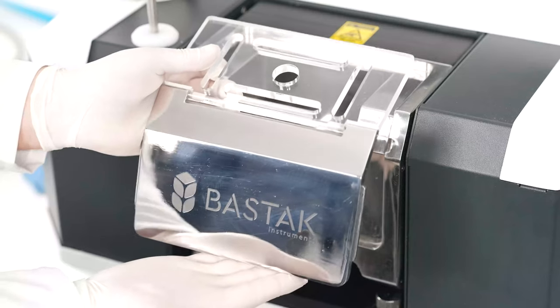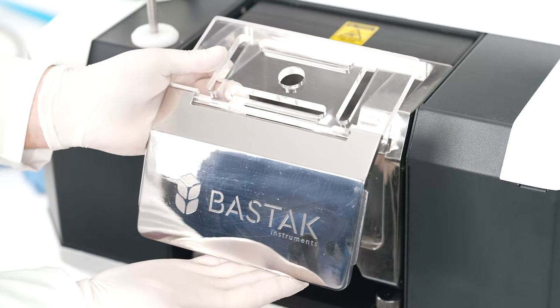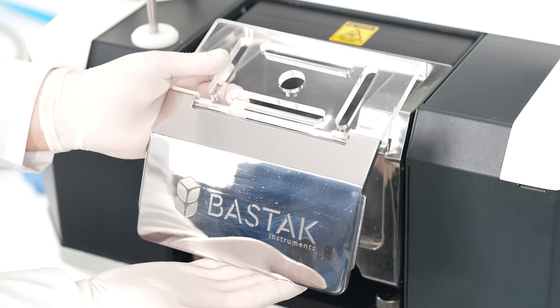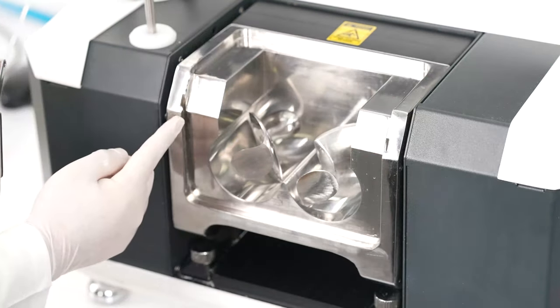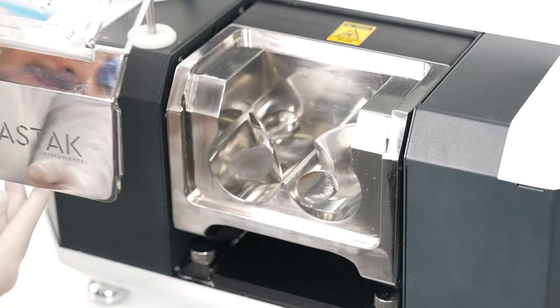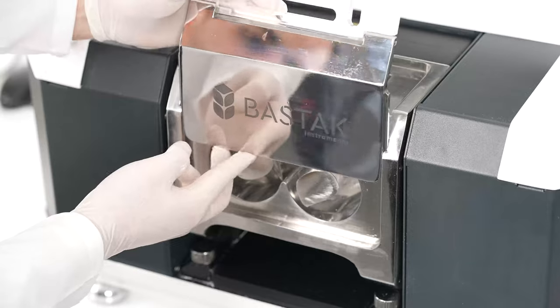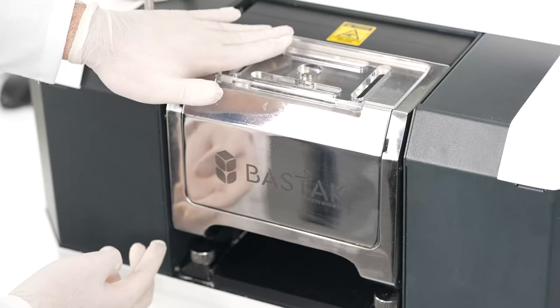The kneading unit hopper cover is a cover made of stainless steel and plexiglass material. The kneading unit cover slots are the channels that allow the cover to be placed on the unit. The lid of the kneading unit is attached and the device is ready for analysis.